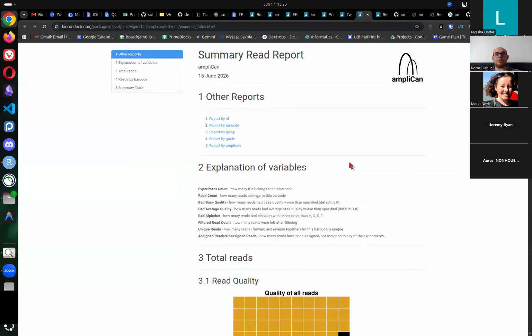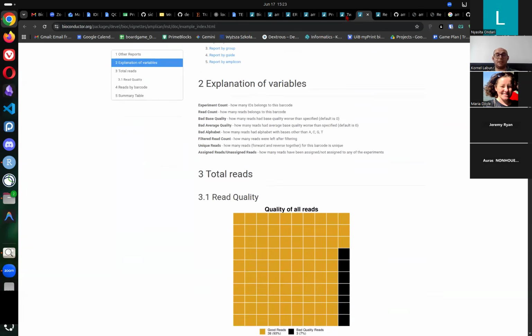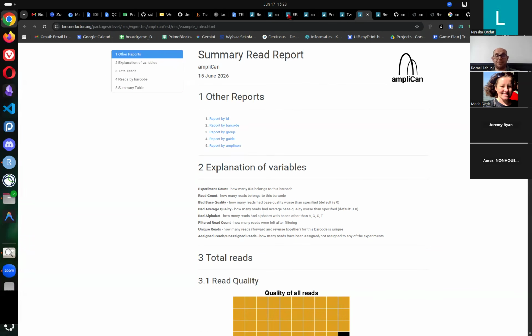Yes, and then you can also play around with just editing the reports themselves. So this is also a useful trick whenever you want to adjust some plots or you don't like how it looks, you can change everything there because this is just normal, regular RMD, which you can edit whenever you like.